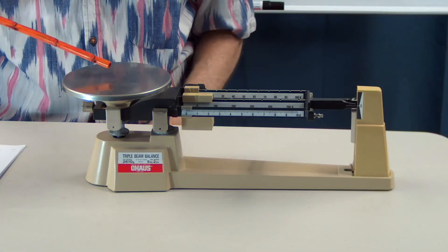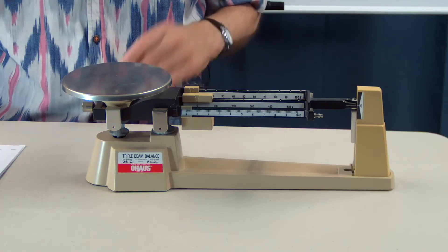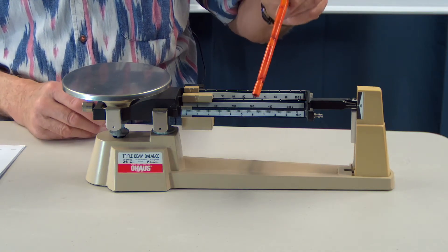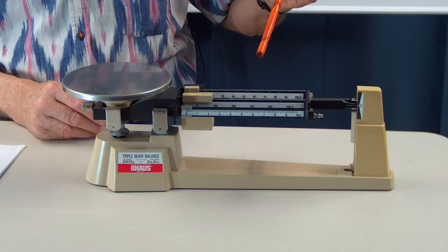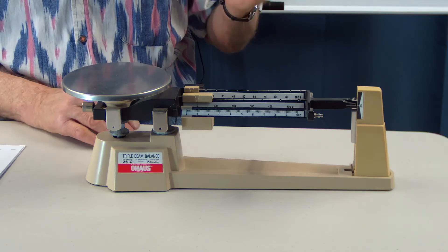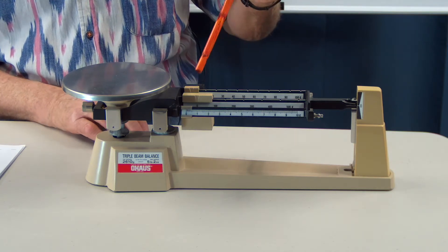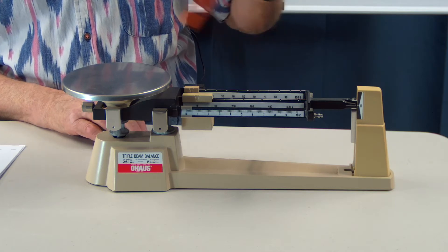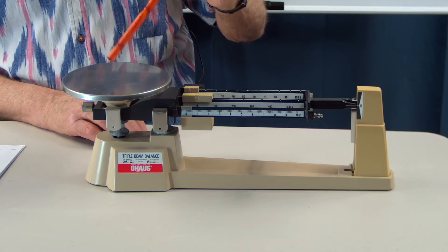This is the platform where the samples are put. It's called the triple beam because these are the three beams or three slides that have the counterweights. In case you've ever heard of the term 'poise,' these counterweights are also called poises. These are where you slide the weights along to balance out whatever is on the platform.